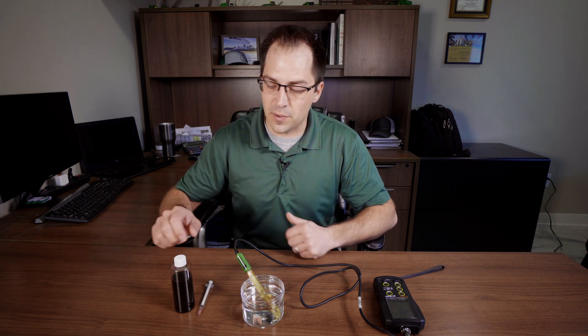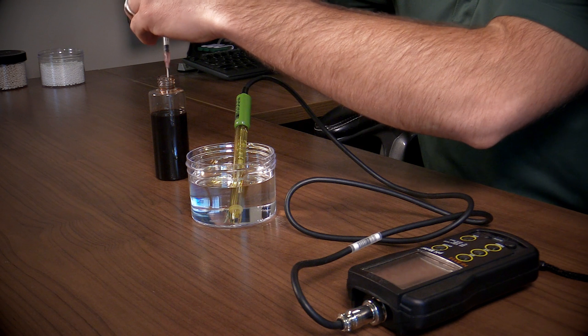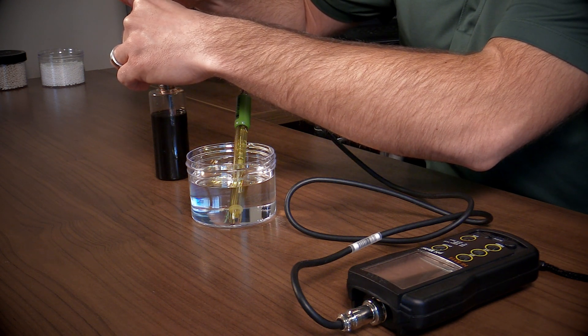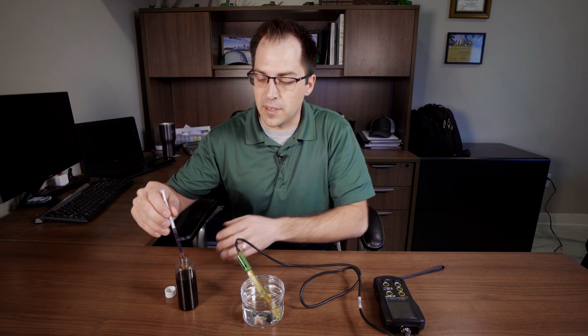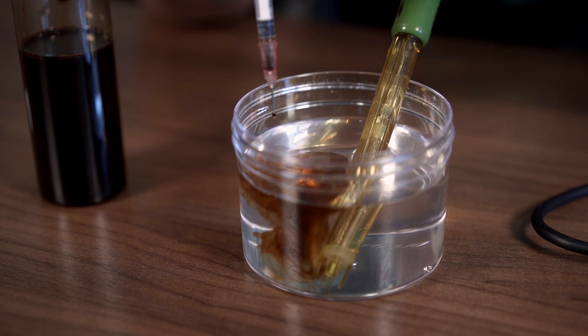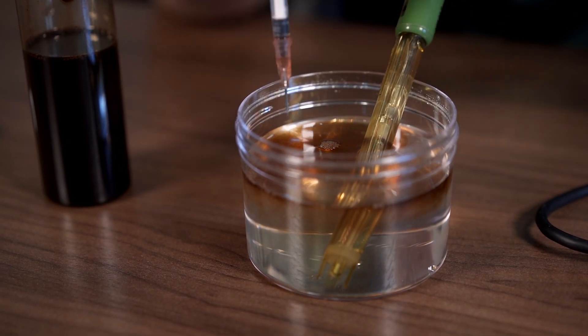We've got our UAN 28%. We're going to put in about 0.75 milliliters of C-Tain into the eight ounces of UAN solution, which is going to represent a use rate per acre of 6 ounces of C-Tain in 16 gallons of UAN.